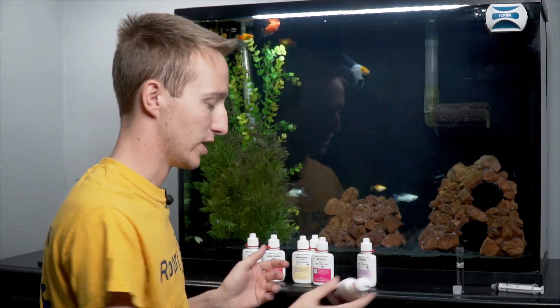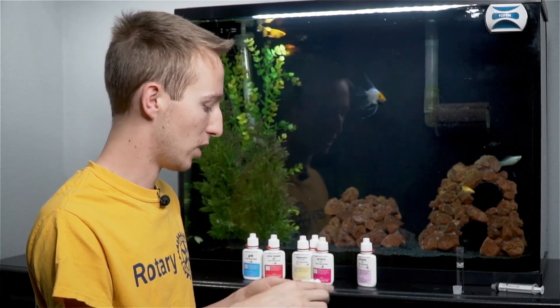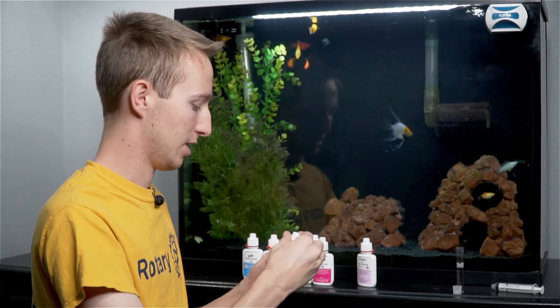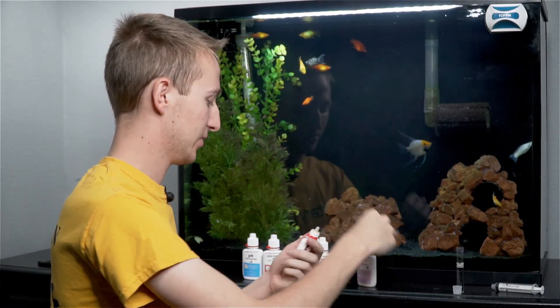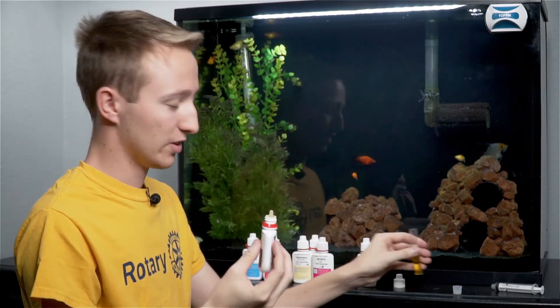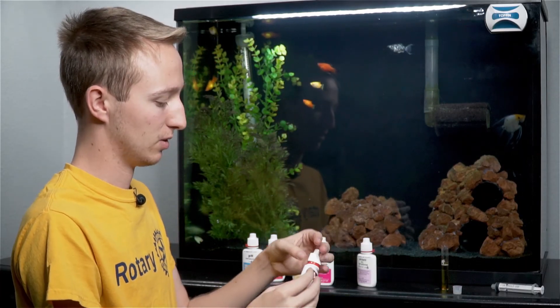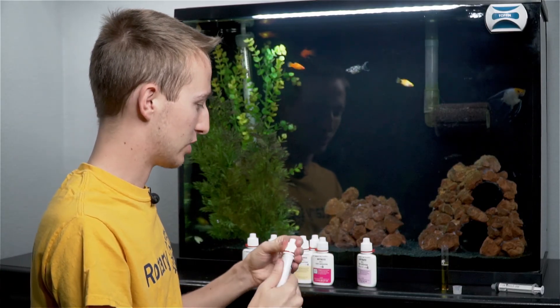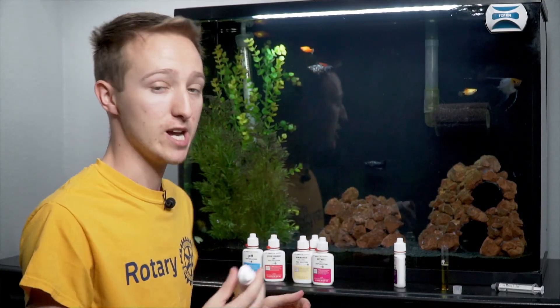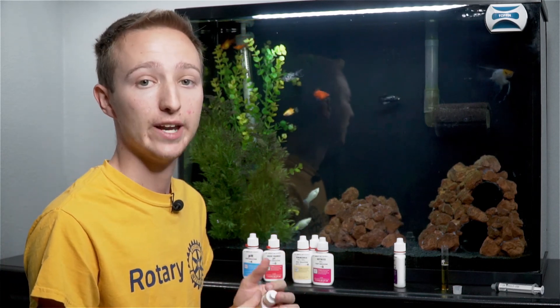The last one is nitrate — this one's actually probably the most complex. I like to give bottle number one a little shake just to make sure everything's mixed. This one has 10 drops you've got to add to it. This one also smells really bad — it's almost like Seachem Prime type of deal. Then bottle number two you're actually supposed to shake vigorously for 30 seconds before adding it.